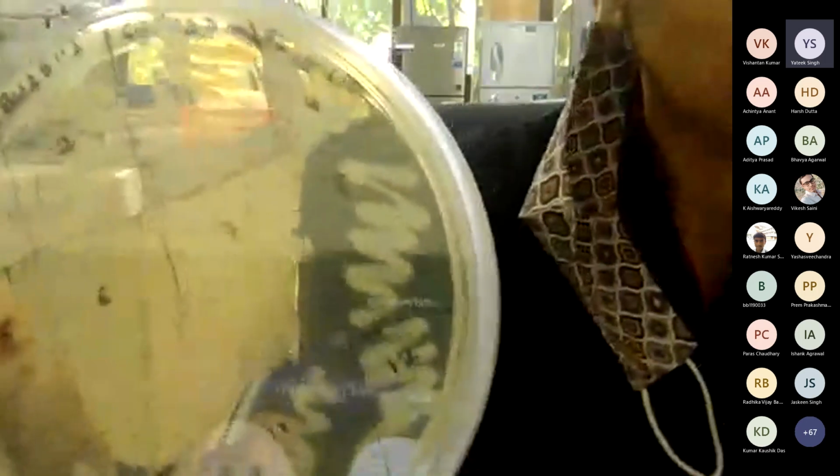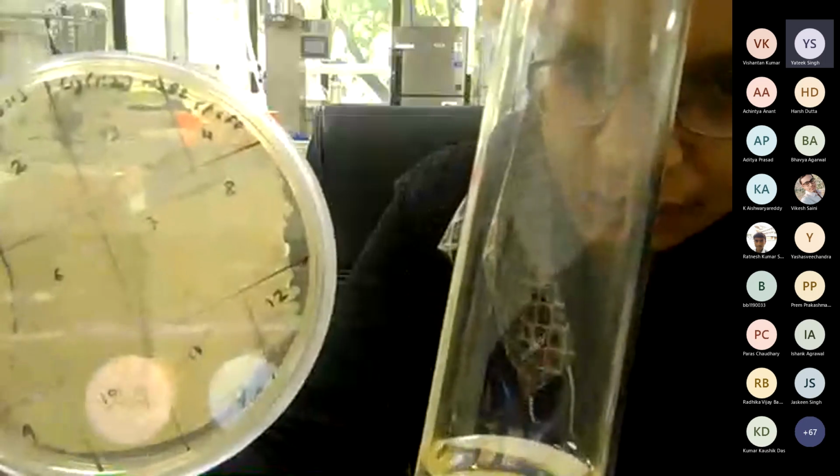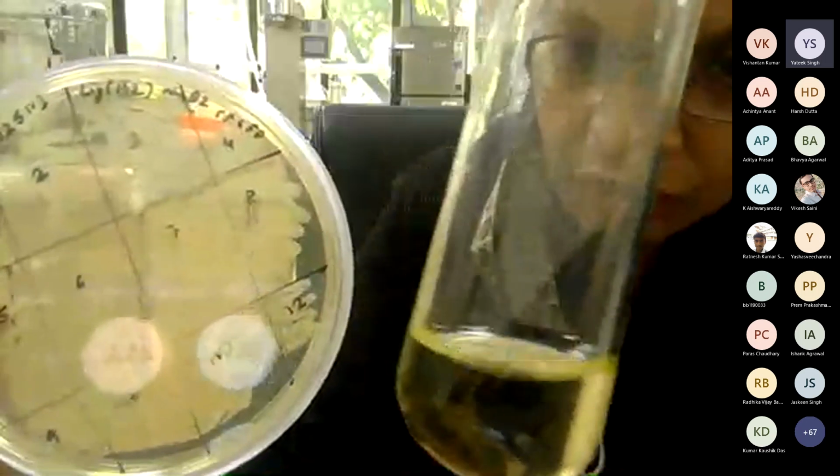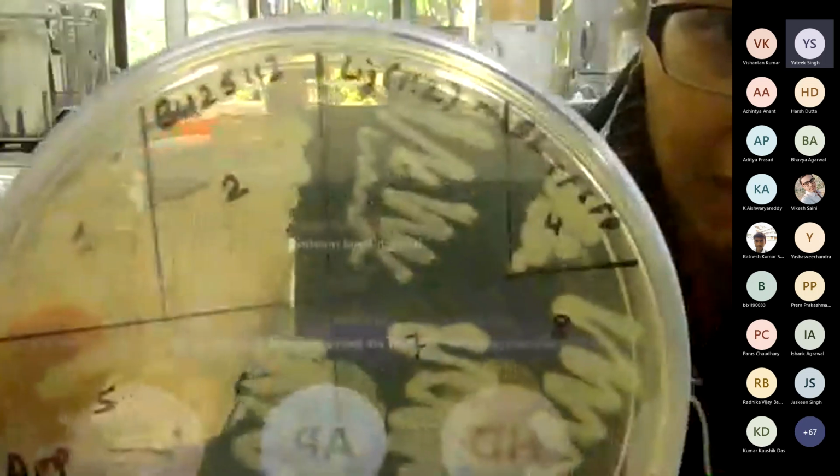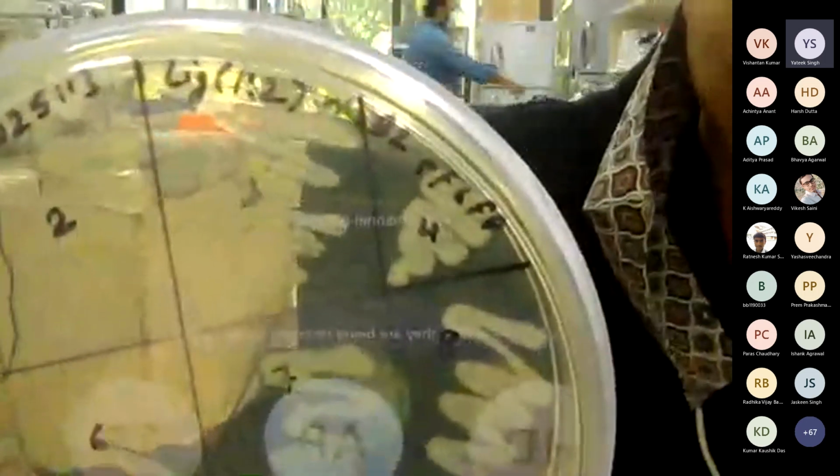From this plate, we inoculate a single colony into a 5 ml culture tube for our protein of expression. These clones are the ones which have our recombinant DNA, having the plasmid and our gene of interest.